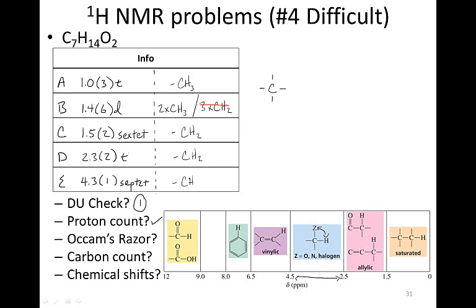So if we take a look at this CH, a very likely kind of framework that we could talk about is if not only do we have a hydrogen here, but we also have oxygen, which makes sense since our original molecular formula has 2 oxygens attached. So that seems to explain that chemical shift. We've already explained the integration. Next thing along the line is to try to explain the septet.